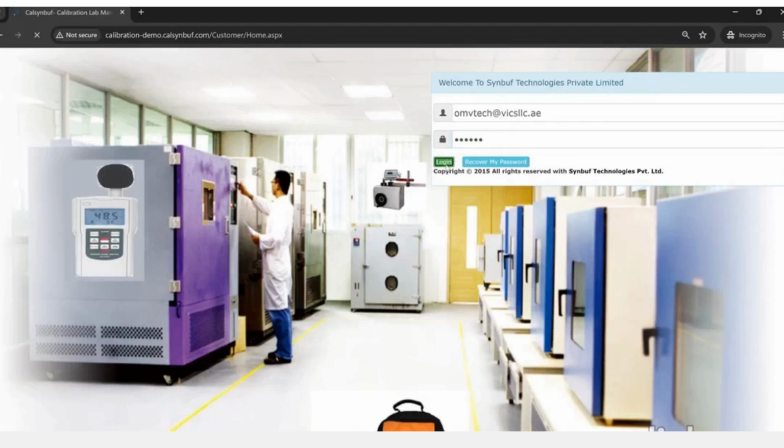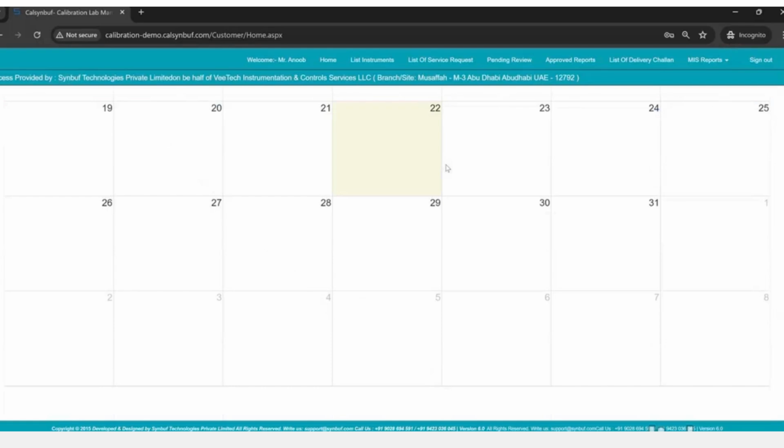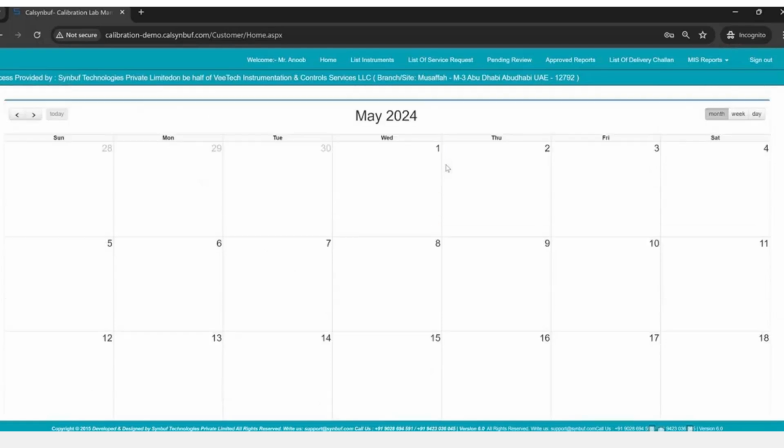Once I log into the system, I can see the calendar. Right now, I can see the counter here. Let's say May, June, July, August, September, October, November. I'll go to next, May.